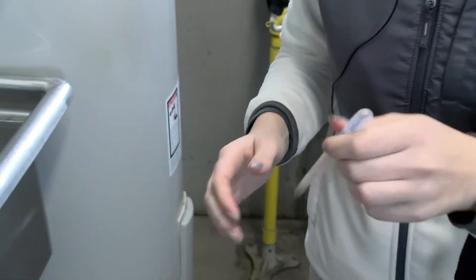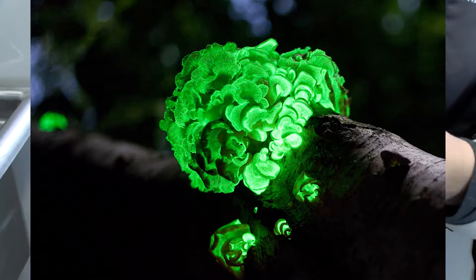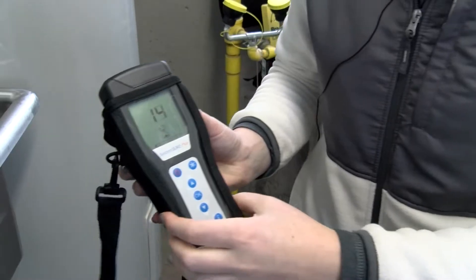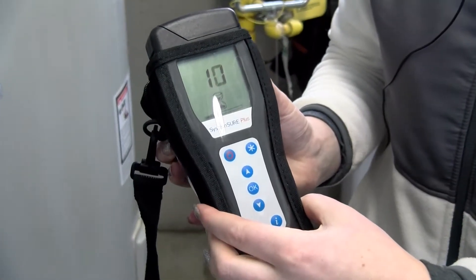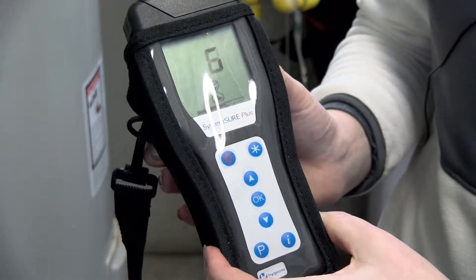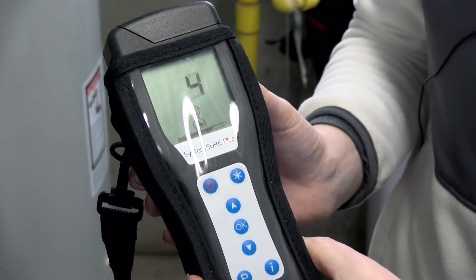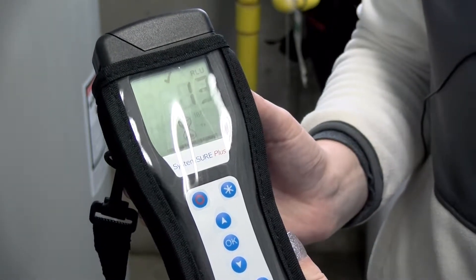The ultra-snap testing swabs have a bioluminescence enzyme that reacts to the presence of ATP. The more ATP present, the greater the luminescence. The luminescence value is reported as relative light units, or RLU. If a low RLU reading is obtained, then very little ATP is present on the surface, and the surface is considered clean.